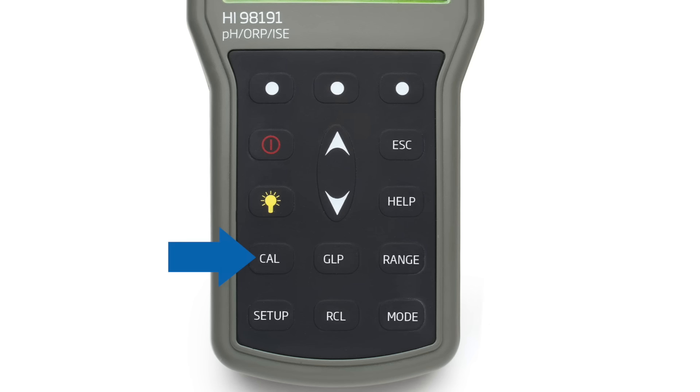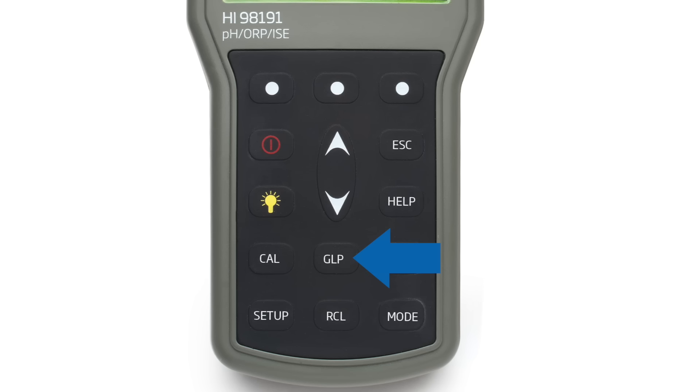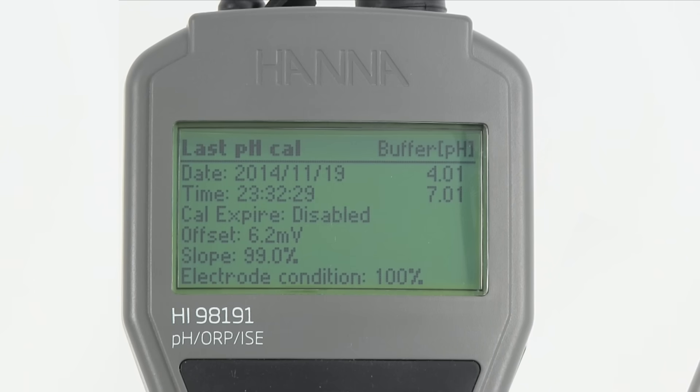Pressing the dedicated Cal button allows users to enter automatic calibration. Calibration data is stored upon exiting and can be reviewed by pressing the GLP button. The GLP data includes the last calibration date and time, days to expiration when calibration timeout is enabled, calibration points, offset, and slope percentage.